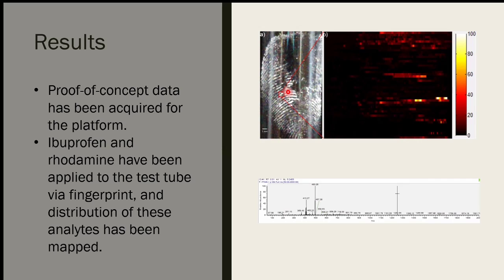Okay. So I guess it's not a destructive technique, but it does change your surface a little bit by the fact that it's having to pick up the analyte. Is that a reasonable way to put it? Yeah, it can also cause some minor scratching of the surface as well, just because you're running a sharp object over it. Okay, that makes sense.